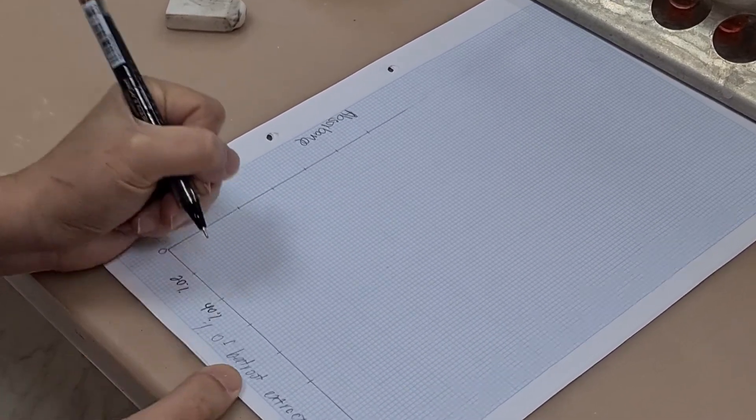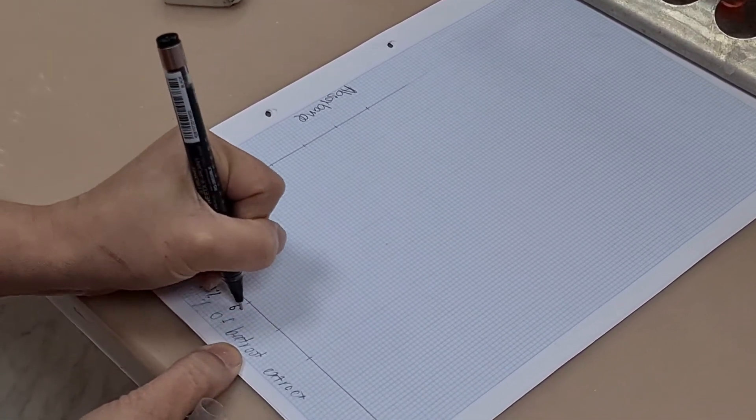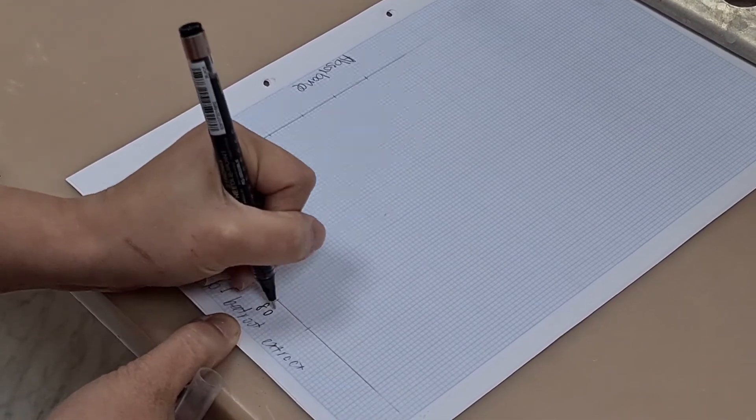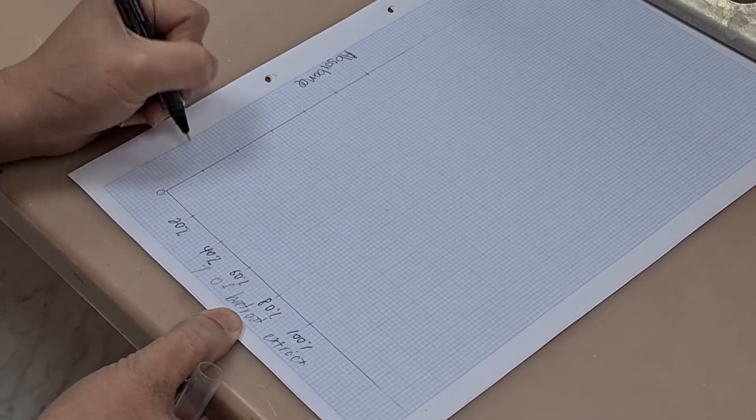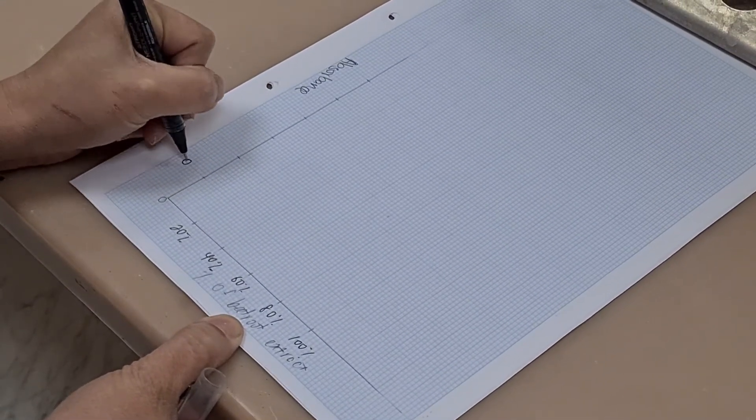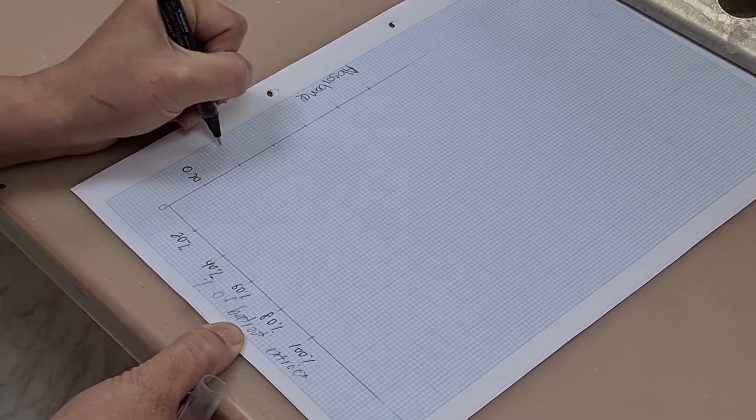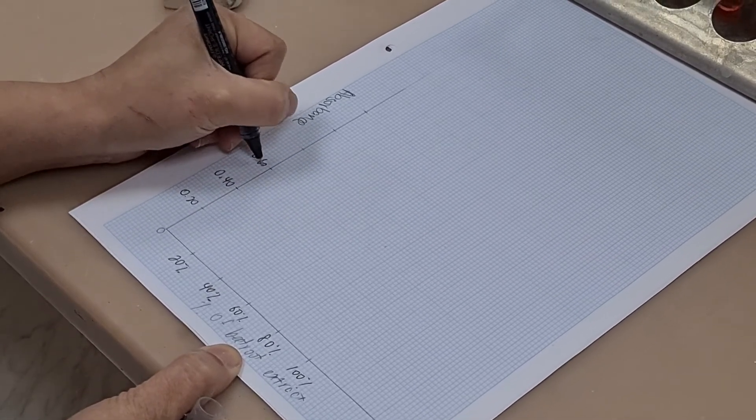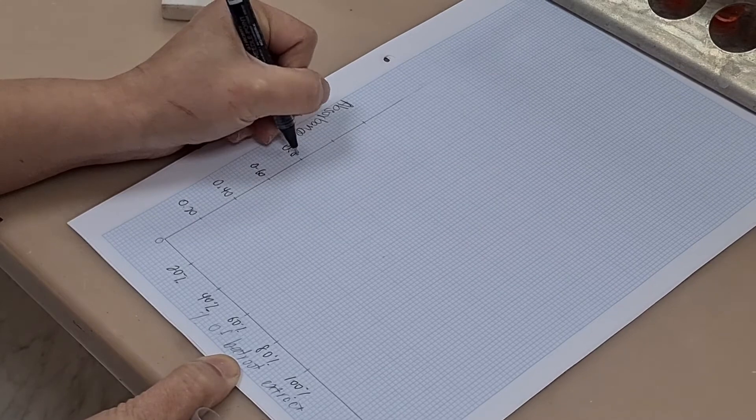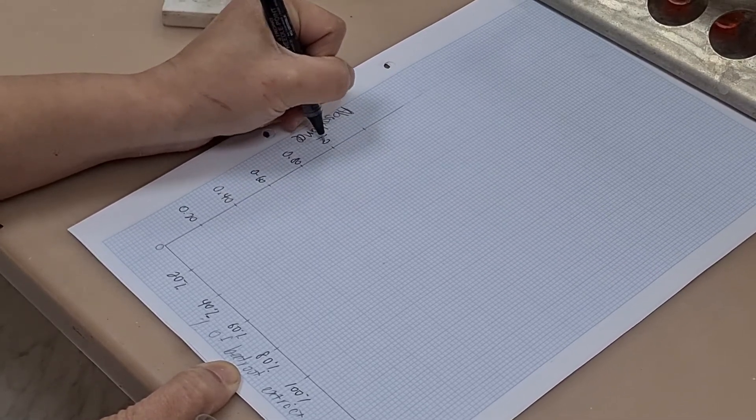So to summarize the answer to the question, why do we produce a calibration curve? We produce a calibration curve to identify the concentration of unknown substances. And how do we do that? We use known concentrations to plot a graph of absorbance.